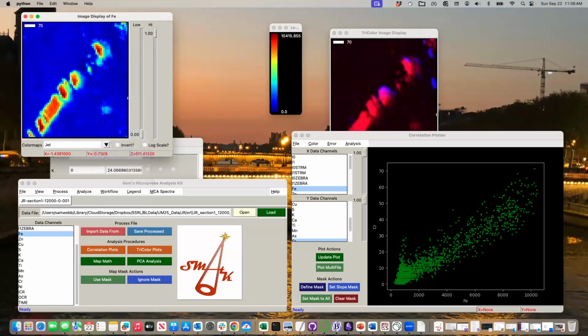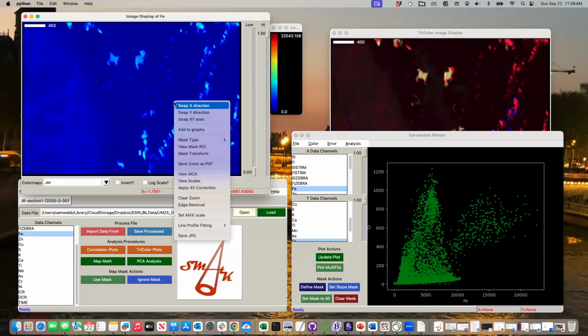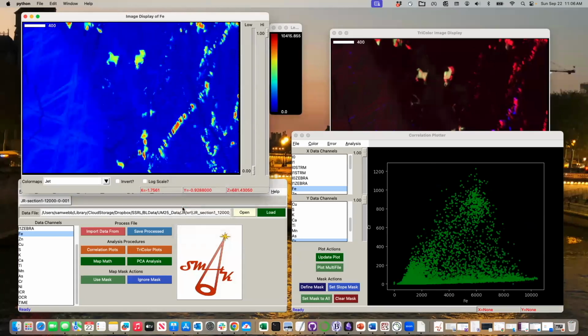And we should hopefully see, you'll often see some weird things when you look at your unzoomed data because you have that strange pixel on the left side here creating artificially high things. If all your data is really low, you'll see all your data clustered over here and all your really weird data on the far right. And so again, if we do that edge removal, it'll automatically look much better.